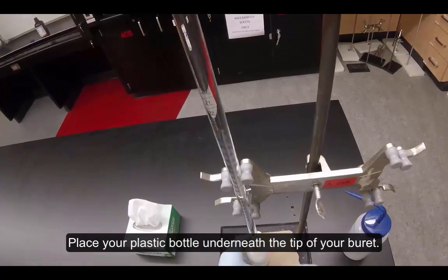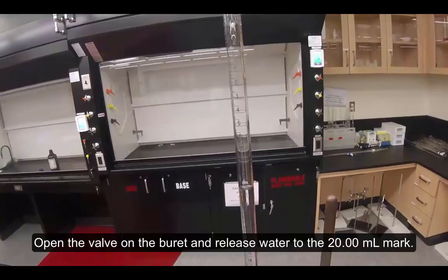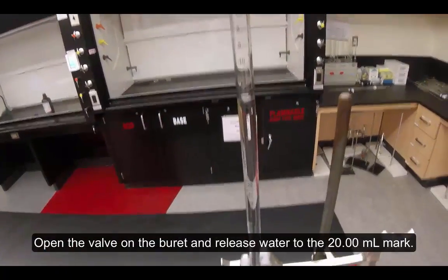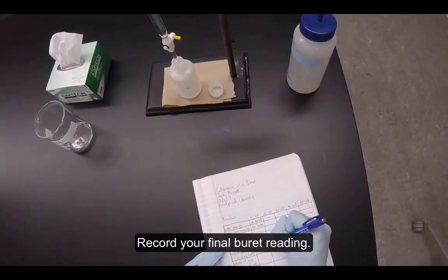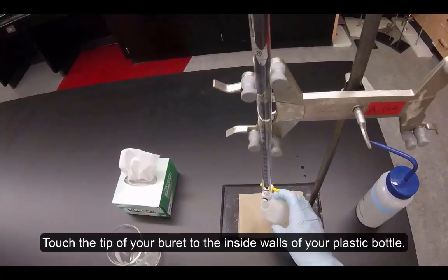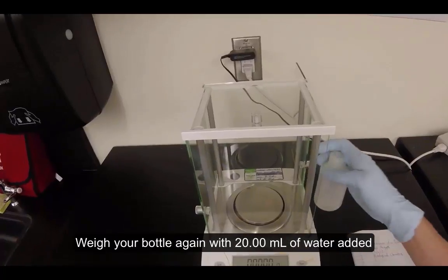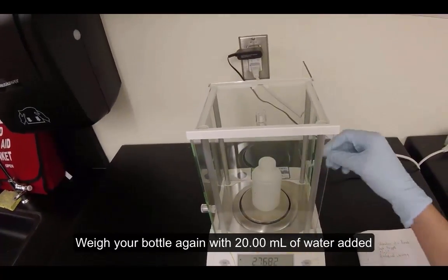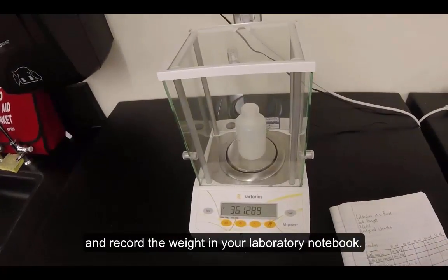Place your plastic bottle underneath the tip of your burette. Open the valve on the burette and release water to the 20.00-milliliter mark. Record your final burette reading and touch the tip of your burette to the inside walls of your plastic bottle. Weigh your bottle again with 20 milliliters of water added and record the weight in your laboratory notebook.